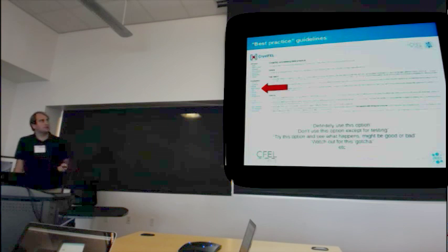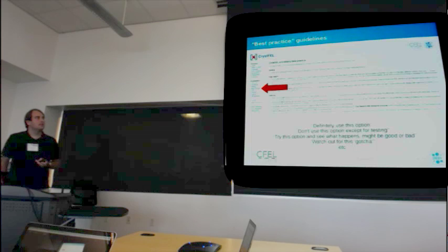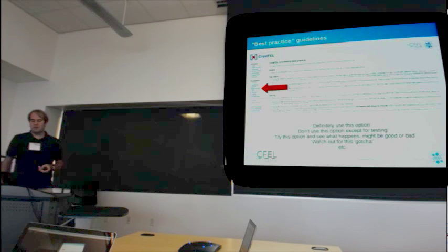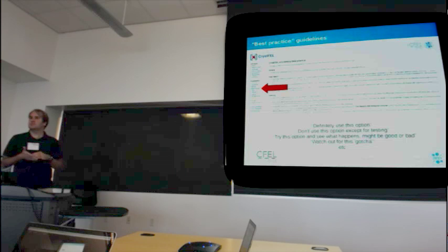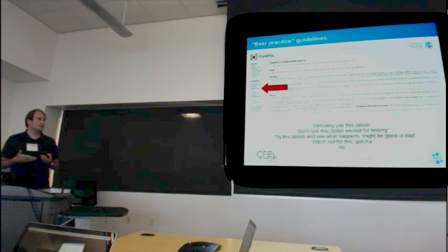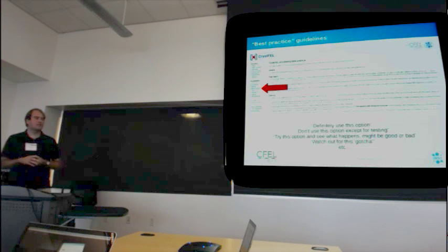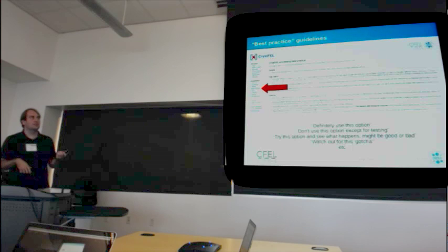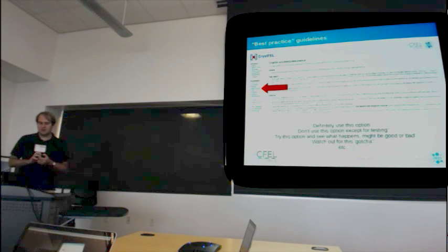If you go on the CrystFEL website, look at the best practice page, it's right here. There's a list for every stage of what you should do. Should you definitely use this option? Should you definitely not use this option unless you're testing something? For some of them it says, try this option, see what happens, might be good or bad, you never know. Watch out for some gotchas, and so on. So have a good read of that page. We'll continue.